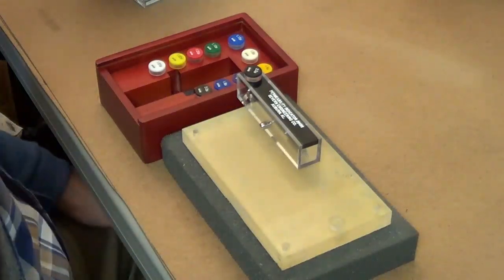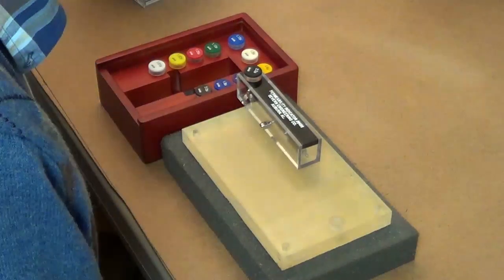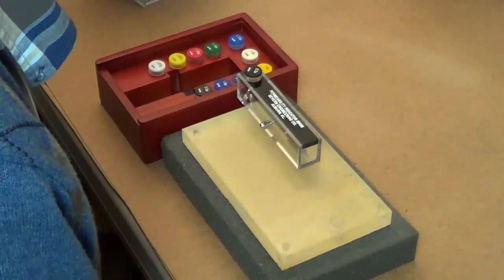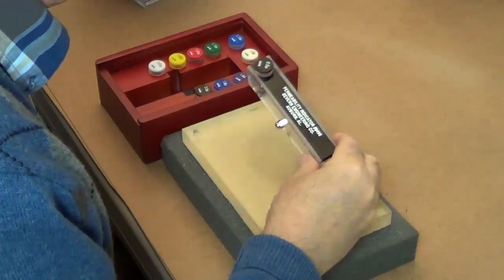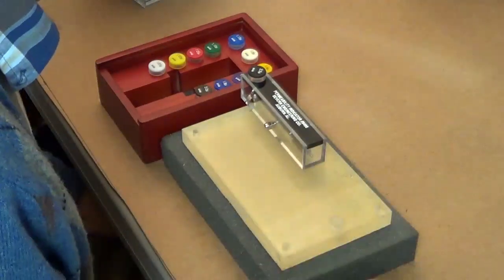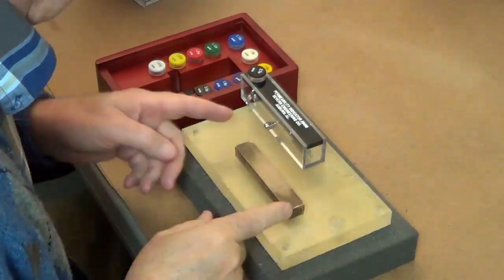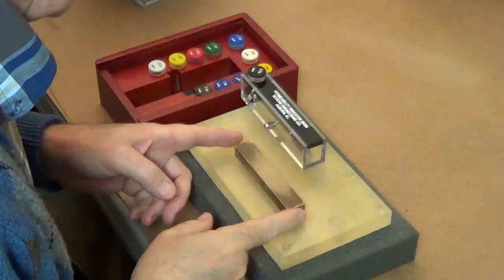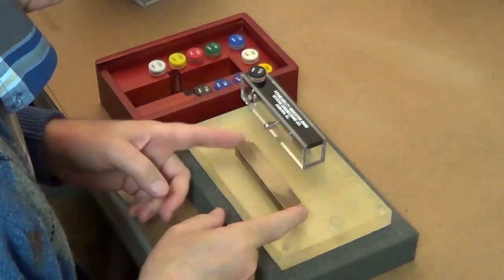Hello. Today we're going to talk about the testing procedure for utilizing the Severn Engineering Permeability Indicator to determine the permeability range, magnetic permeability range, for a metallic test specimen.